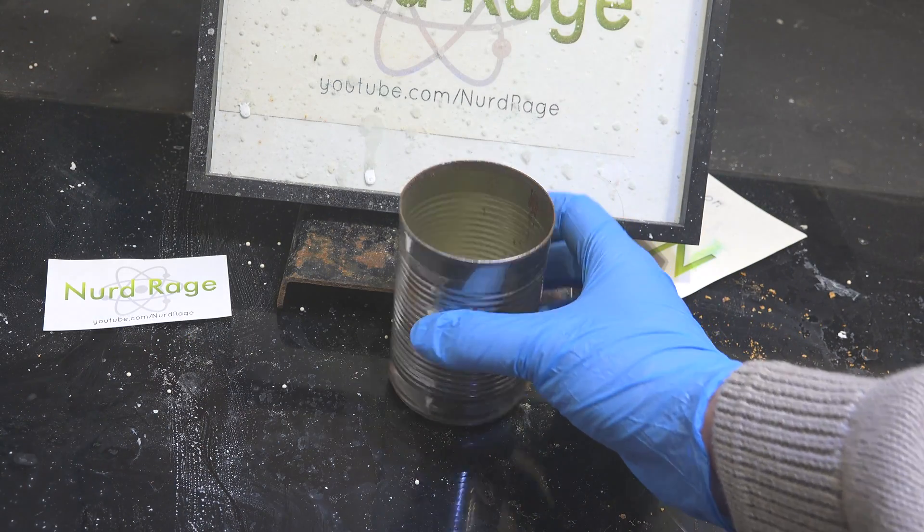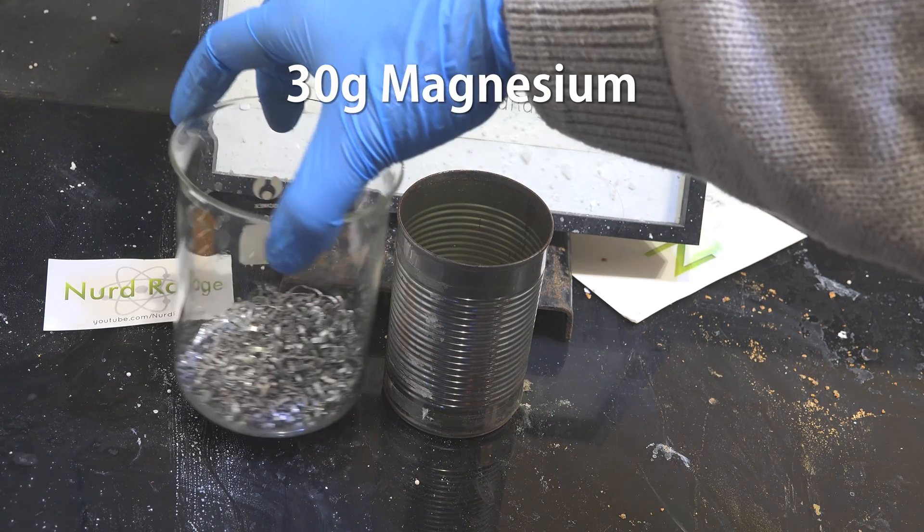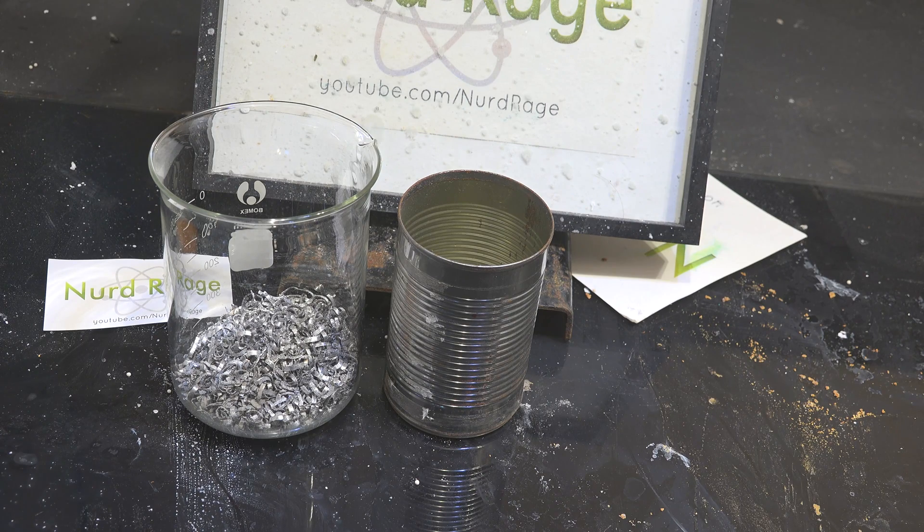First get a steel container. I'm using a steel soup can. Now we get 30g of magnesium metal turnings. Magnesium powder is much better but all I had was these turnings.